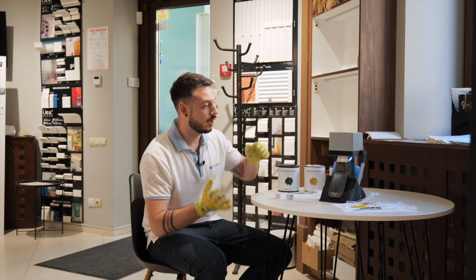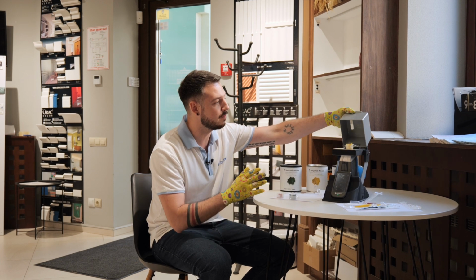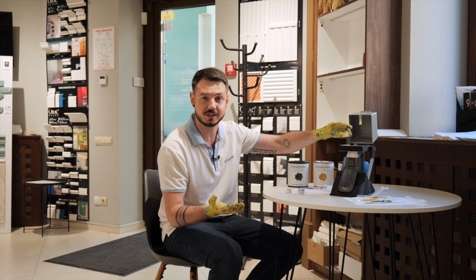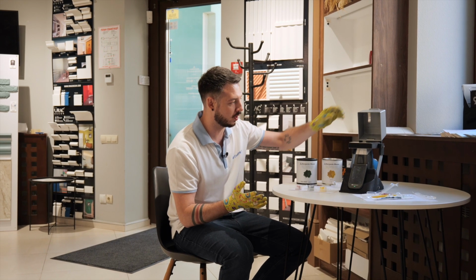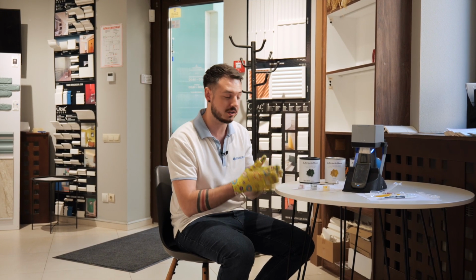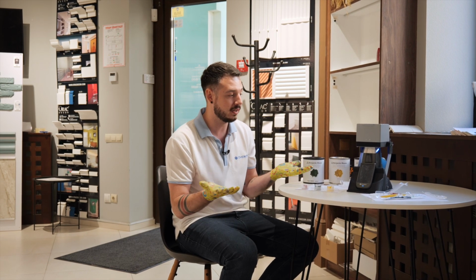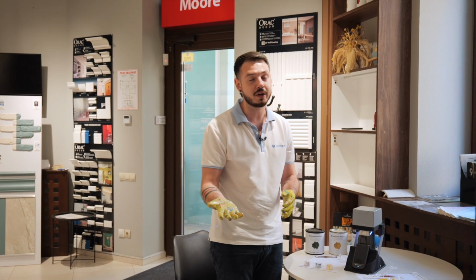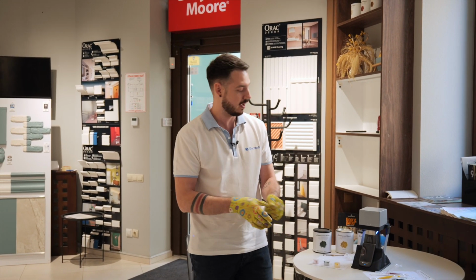In conclusion, we can say that any measurement for lead in paint, especially if you are specializing in it, is really important. And it will be able to tell you if you are strict with some regulations and if you follow them. And in general, if the paint you're working with is safe, because we all know that safety first.